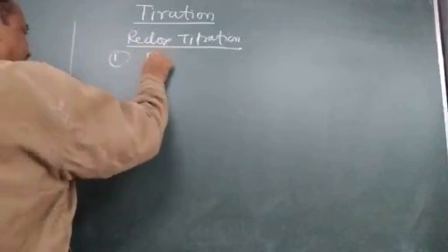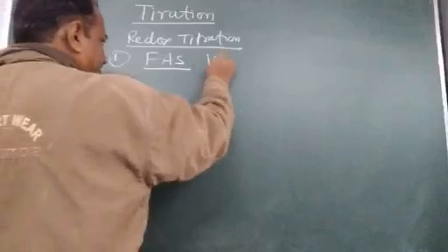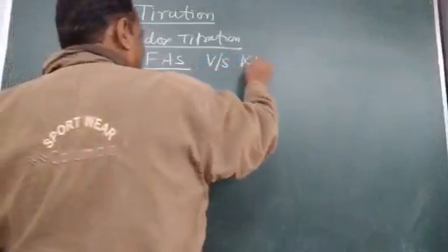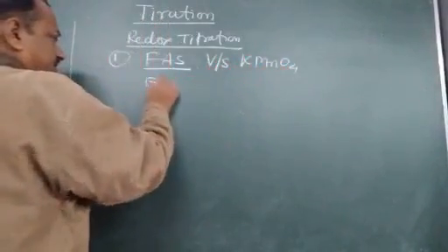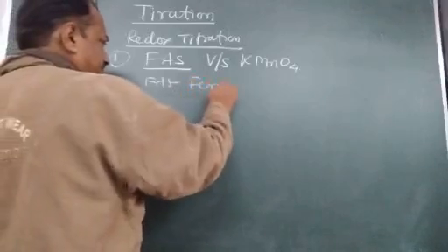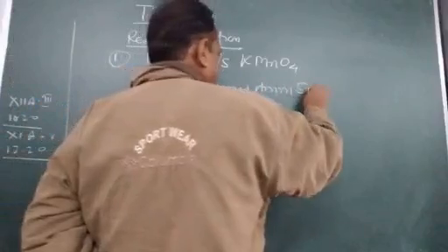One is FAS versus KMnO4. FAS, ferrous ammonium sulfate.